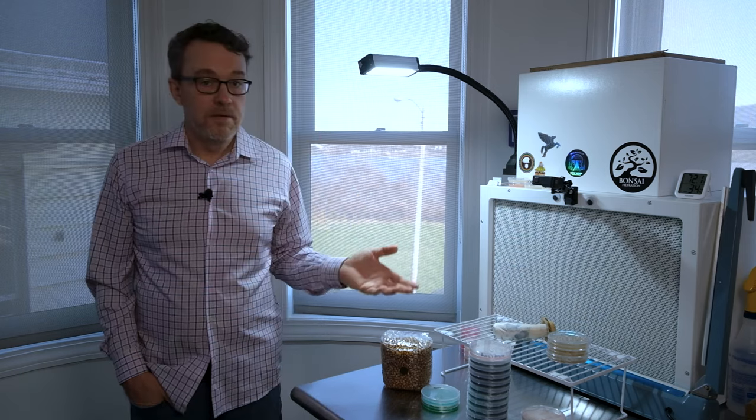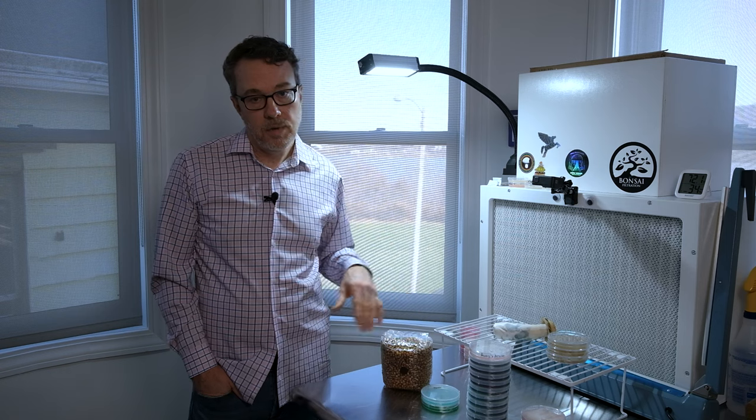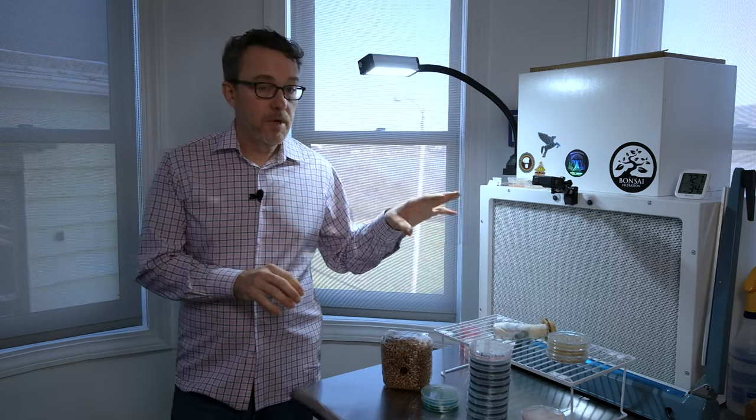Welcome back to Real Simple Mushrooms where we simplify home mushroom cultivation. Today's video is going to be all about agar work — it's going to be a little longer than usual because we're going to cover a lot of topics. Some of the things we're going to cover are supplies, why it's so important to learn agar, and your agar workflow.